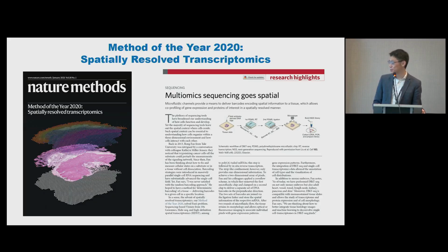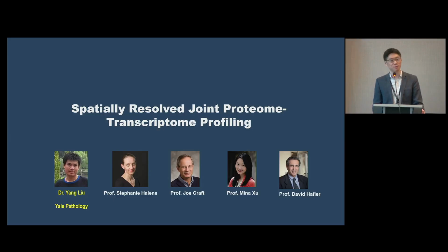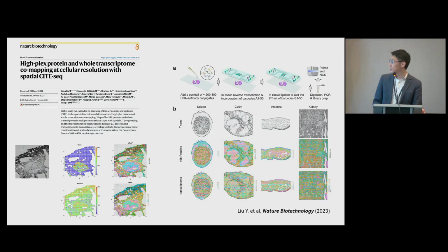And then I asked my student, can we really do hundreds of proteins, potentially thousands of those? I would say for academic laboratories, that's probably a little bit overstretched if you really want to do thousands, just to build that antibody panel. But let's just try hundreds. That's within the range we're able to manage. It's still challenging. We demonstrated it works quite well for both human and mouse tissue and a variety of tissue types. As shown on the right is a variety of different mouse tissue types.